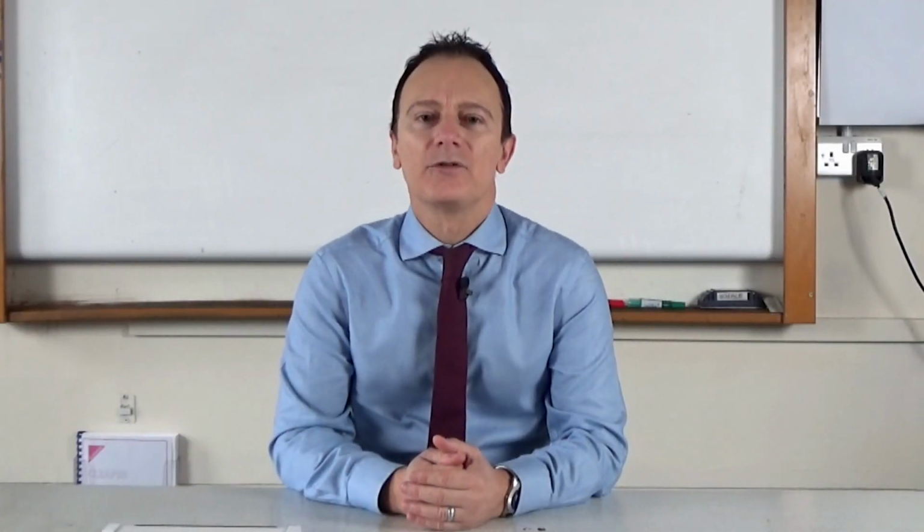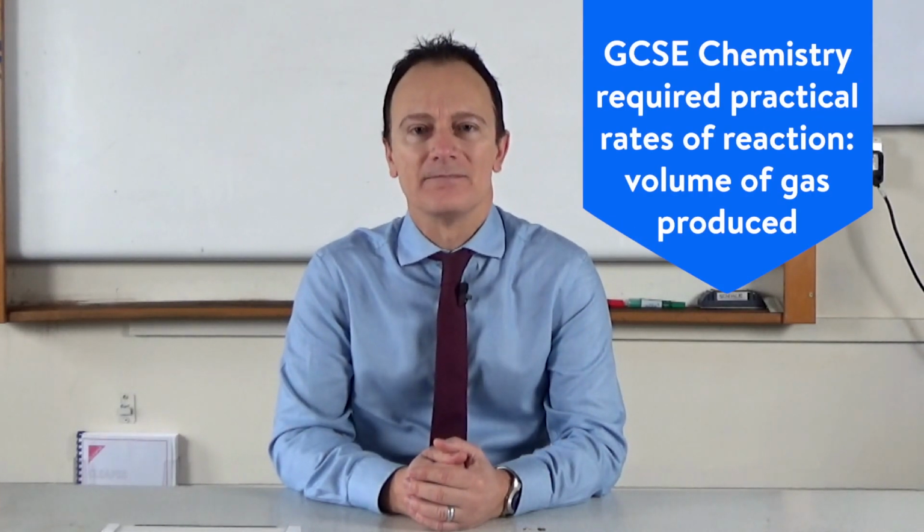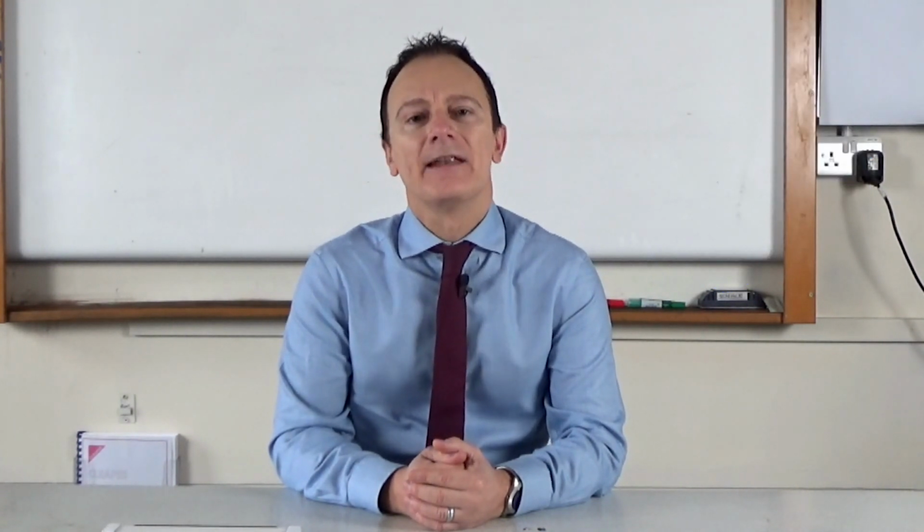Welcome to our video, which will show you how to set up and carry out the GCSE Chemistry required practical on rates of reaction. There's actually two required practicals on rates of reaction, and in this video we're going to show you how you can measure the rate of reaction by measuring the volume of a gas produced.